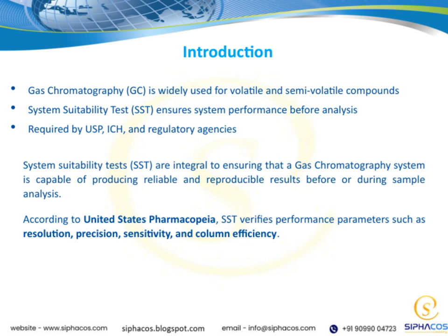They ensure that our system is capable of producing accurate and reproducible results, which is fundamental to the integrity of our analytical work. This is why organizations like USP, ICH, and other regulatory bodies make SSTs mandatory. They help maintain high standards across the board.